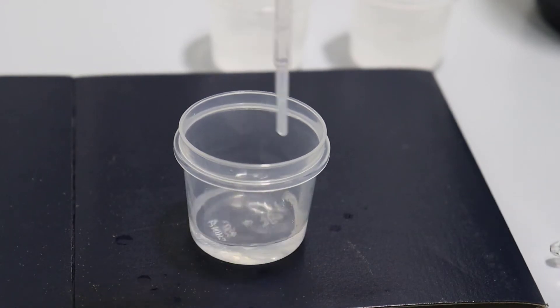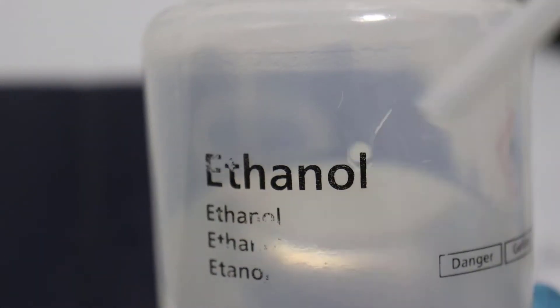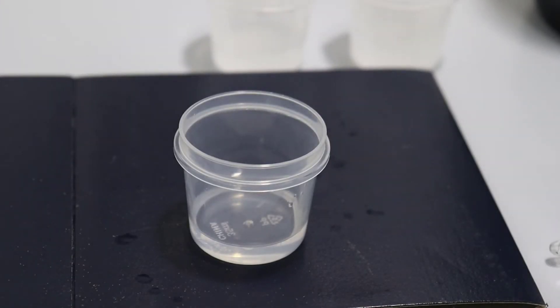What I'm then going to do is add some ethanol to this. I've added about five millilitres of the silane and I'm going to add about the same of ethanol. And then we will add some acid.